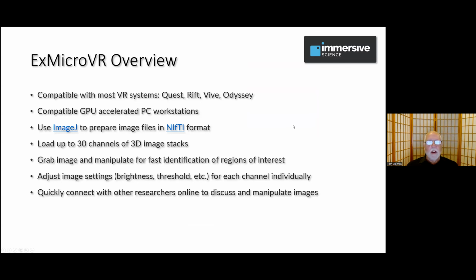So, an overview of the tool. It's compatible with most VR systems like the Quest, Rift, Vive, Odyssey. Let me just pause for a second.